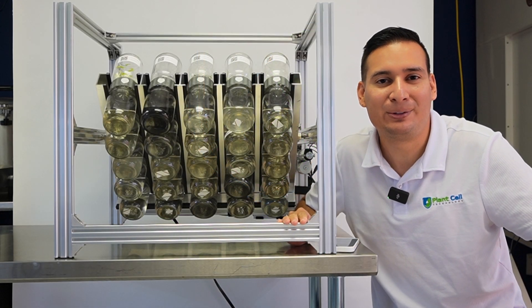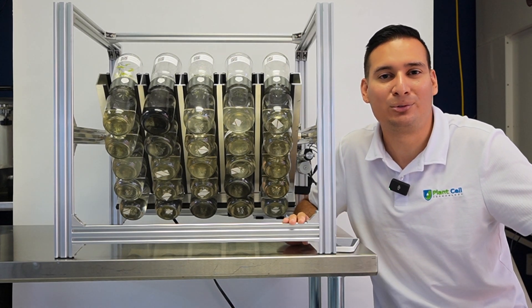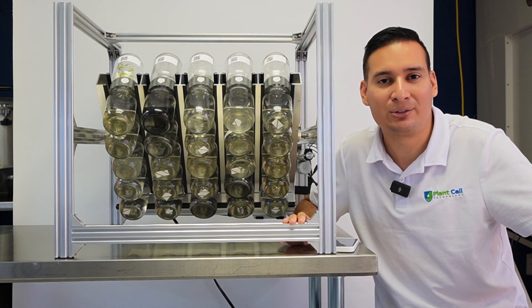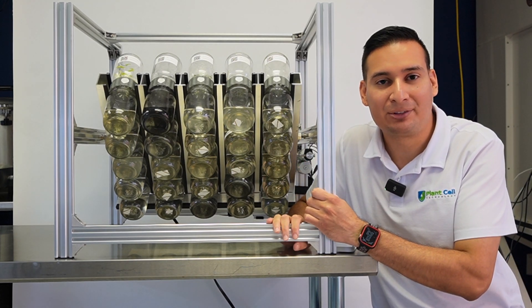Hi everyone, welcome back to another video. Today we are presenting the BioTill — a system that is going to revolutionize the world of plant tissue culture, particularly the temporary immersion bioreactor system.